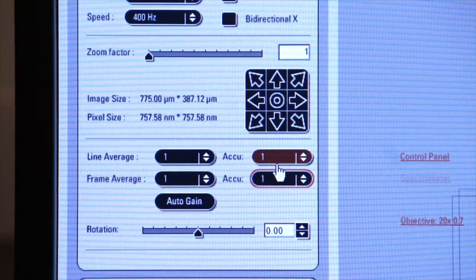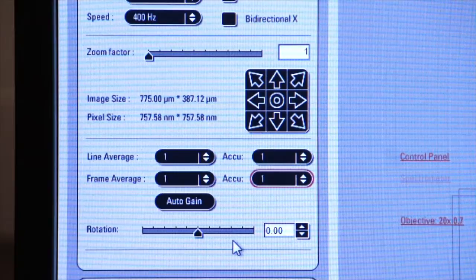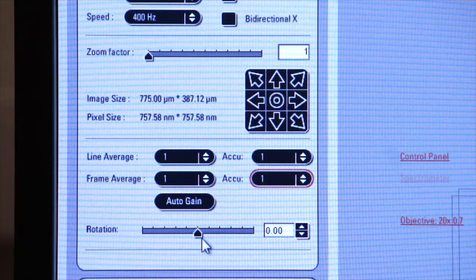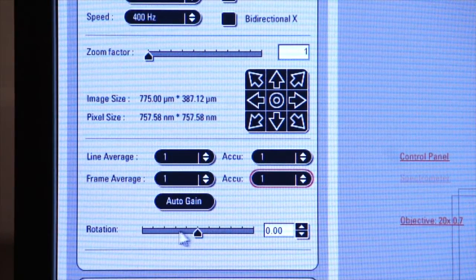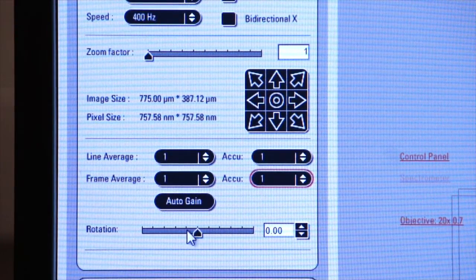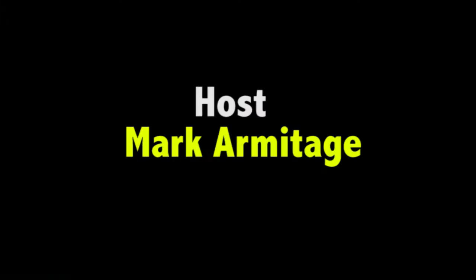Finally, there's a rotation bar here, and that allows you to rotate your image, your digitized image, on the screen.